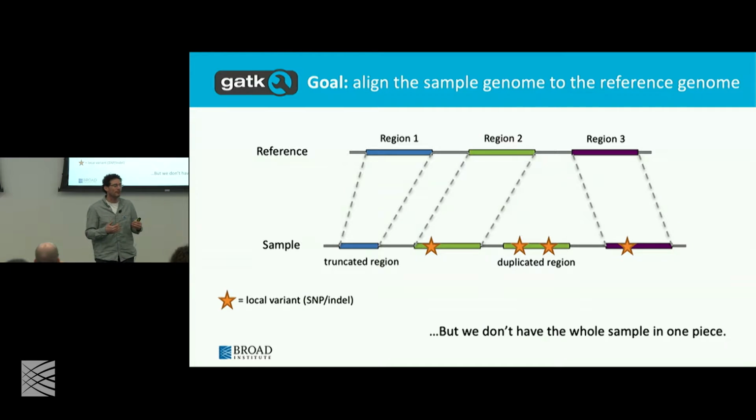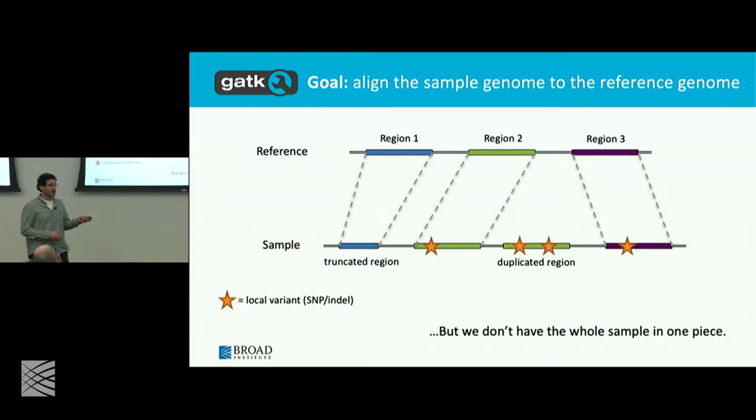How do you find out which copy had these variants and which copy had those variants? We haven't developed, I'm not aware of anyone that has developed tools that will actually open this up from short reads. From long reads, it's easy, right? You read the whole thing through and you're done. But with short reads, it's hard.